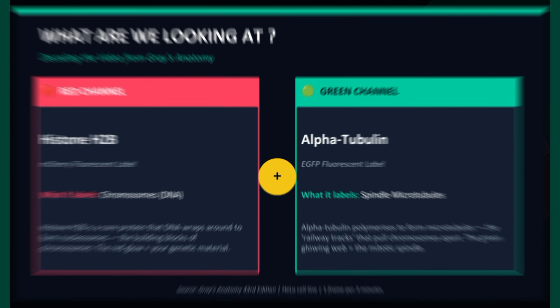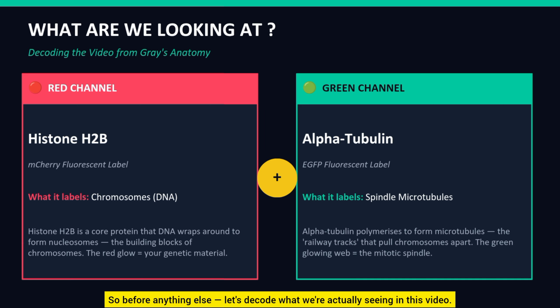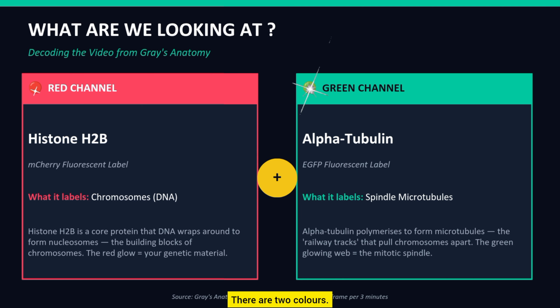Let's get into it. So before anything else, let's decode what we're actually seeing in this video. There are two colors. That's it. But each color is telling you something completely different.